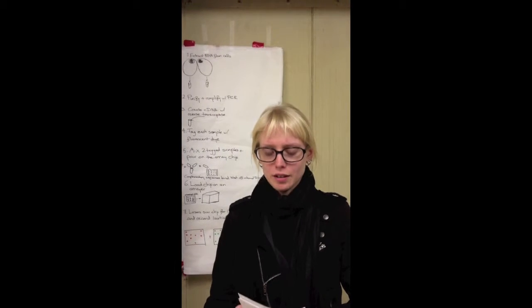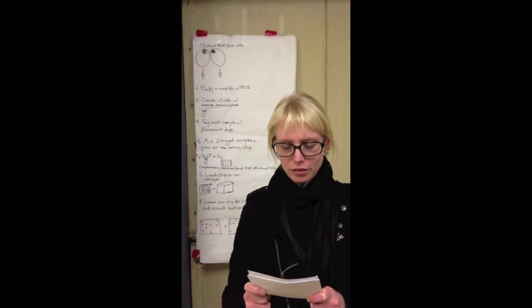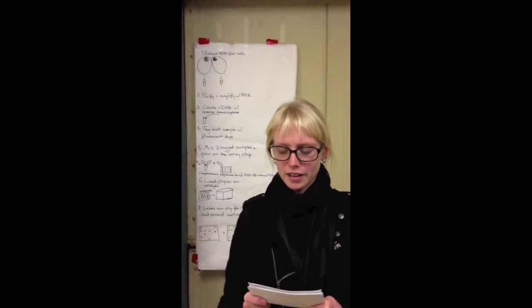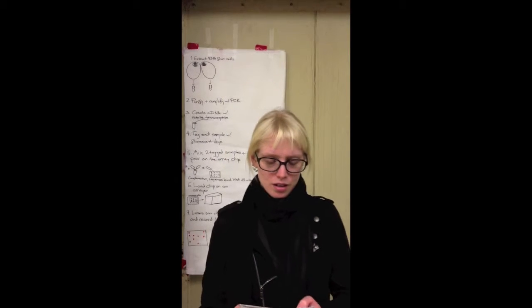I'm Victoria, and I'm working on this project with Joey, and we're doing microarrays. Microarrays were invented in 1991 by Lubert Stryer and Stephen Fodor, founder of Affymetrix, a main producer of microarray components.